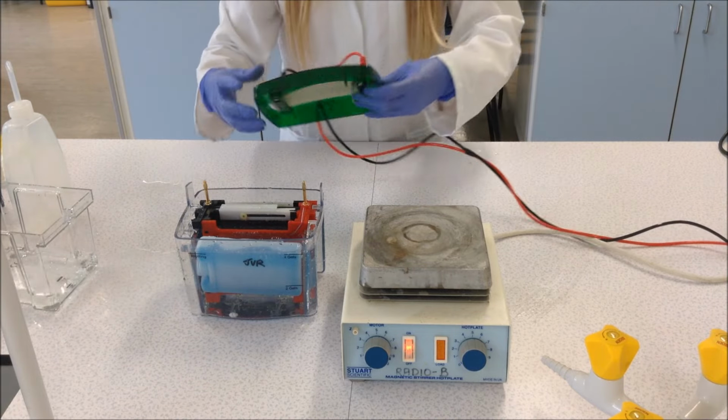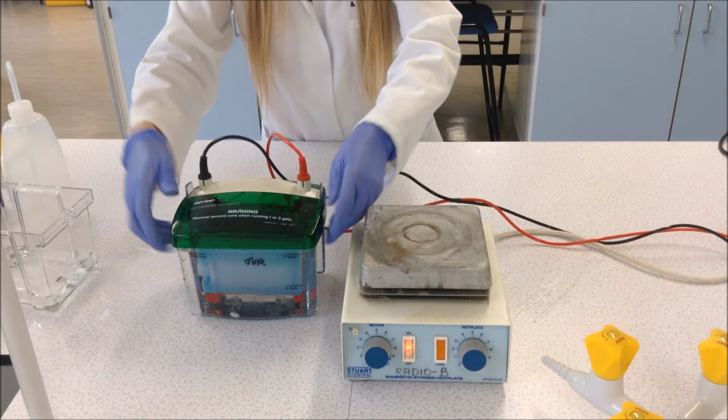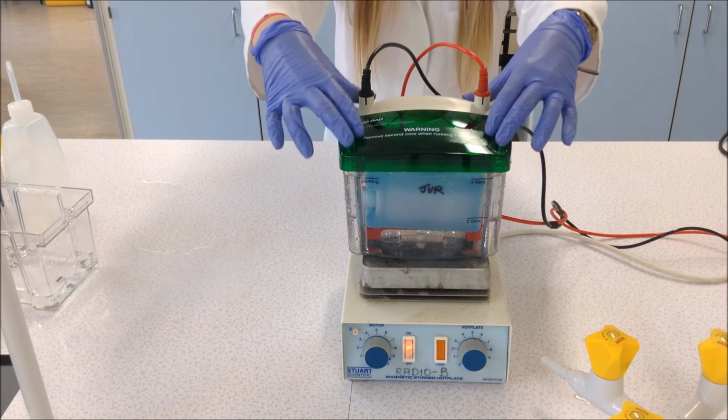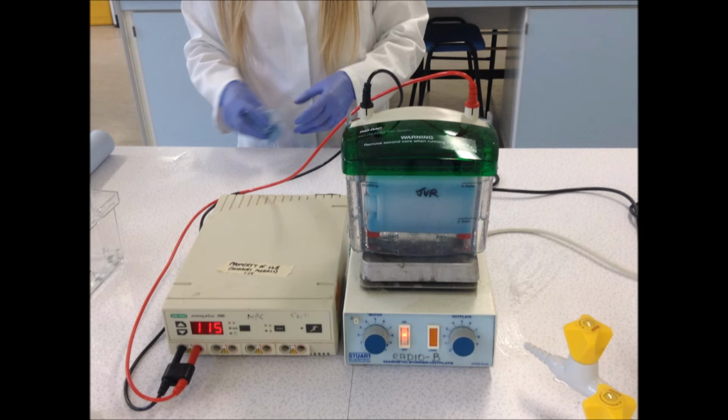After doing so, you can then place the lid back on, again ensuring that the red side goes to the red and the black side goes to the black. You can then place the whole module onto the magnetic stirrer until the transfer process is complete. Power setting wise, the transfer process will occur at 115 volts.